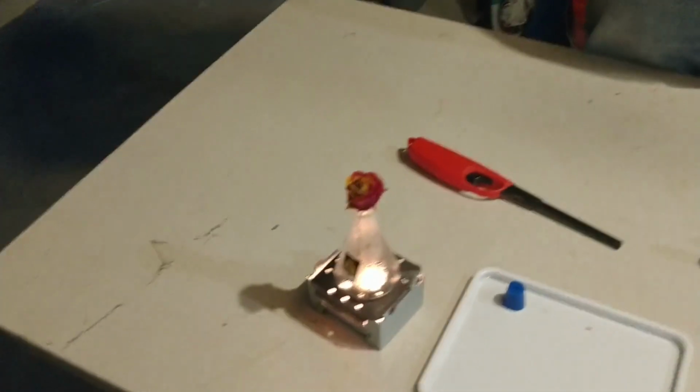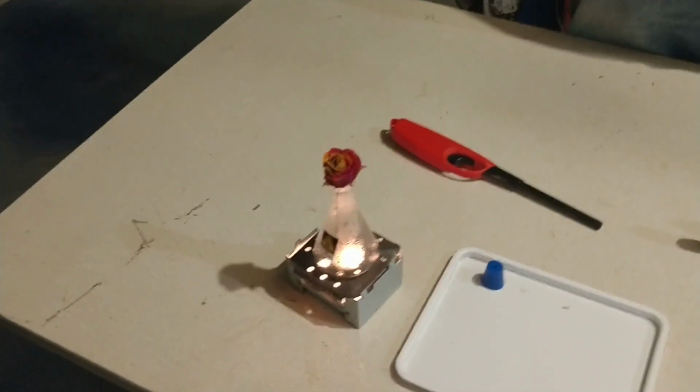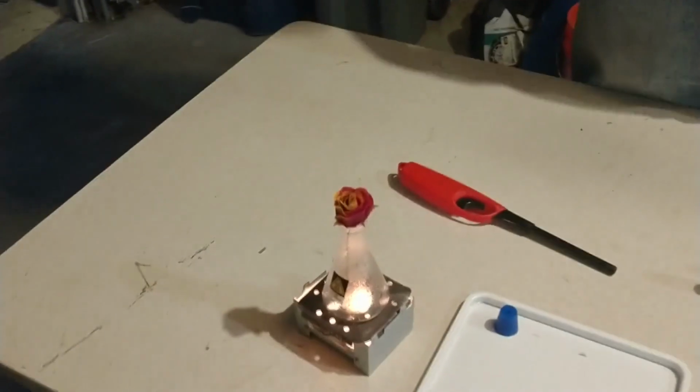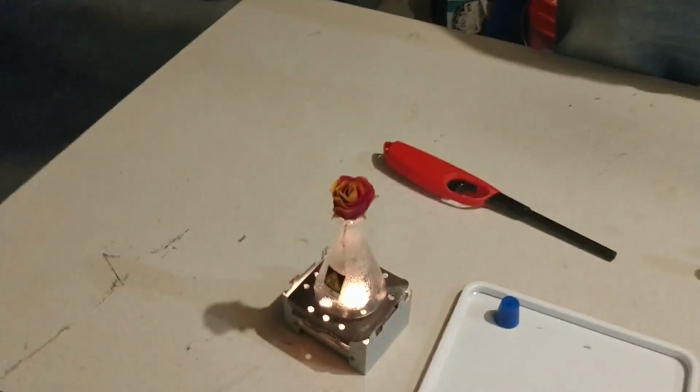Here we've now almost completely changed colors from blue to red as the sulfur dioxide gas inside the flask is coming up and changing the color of the indicator.